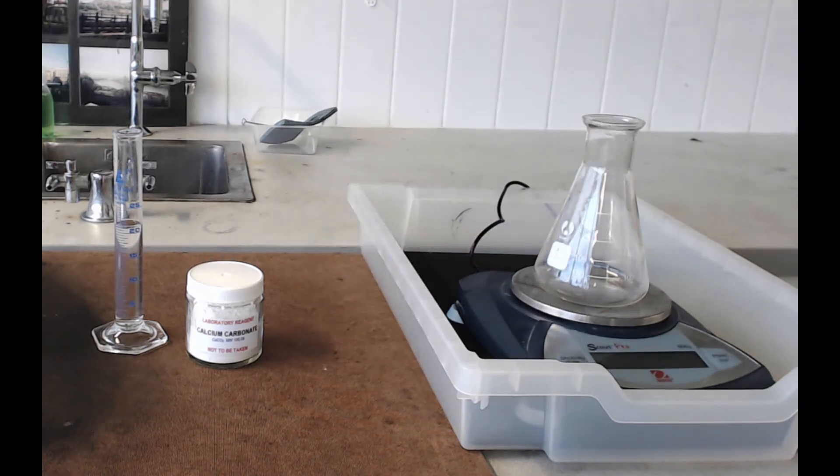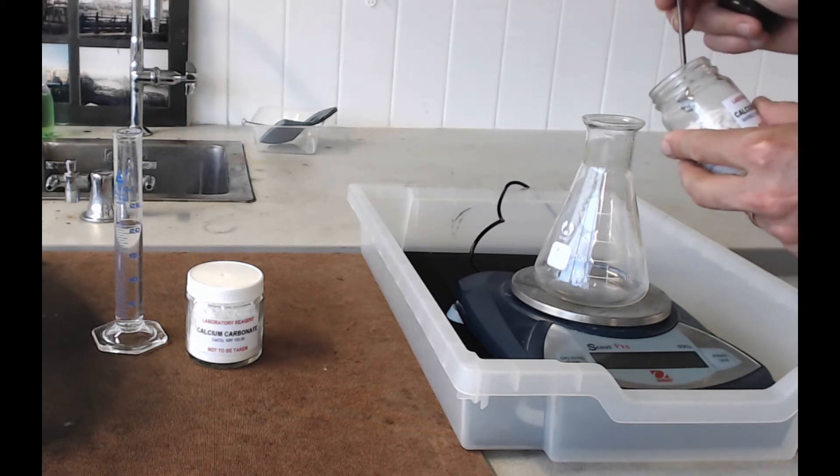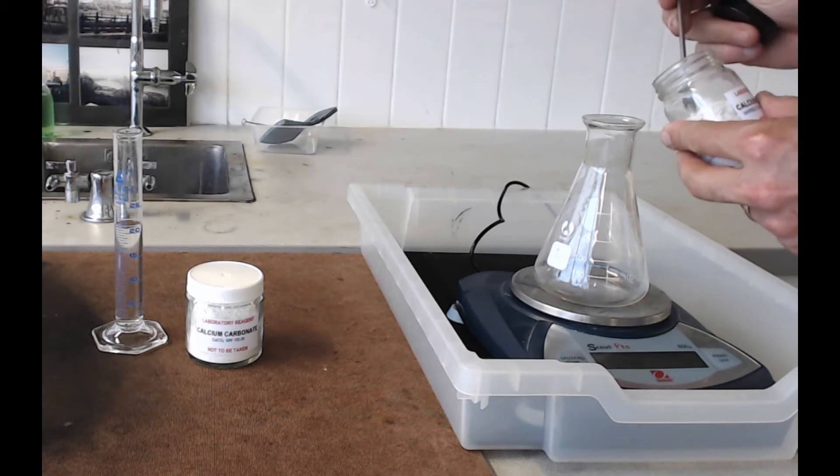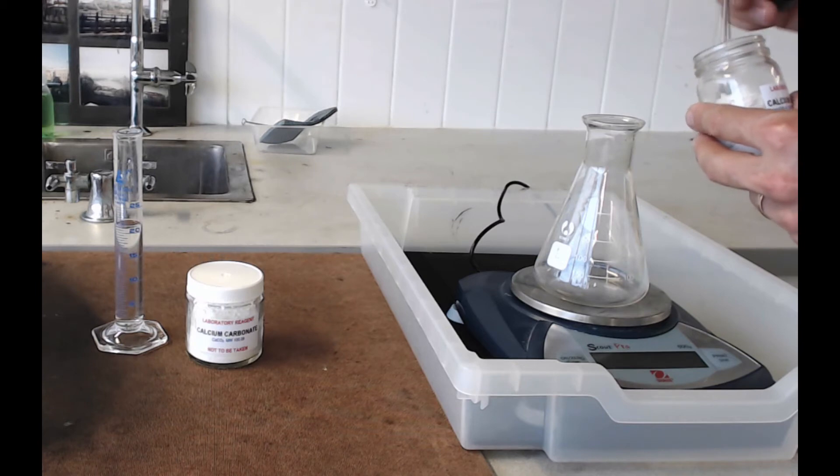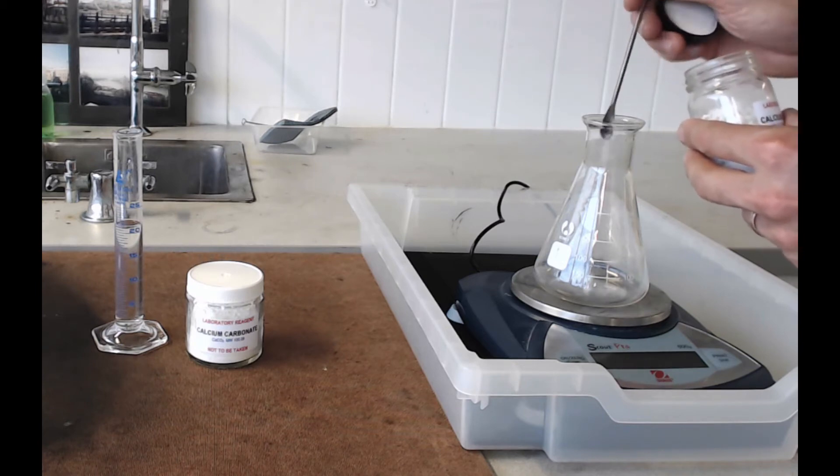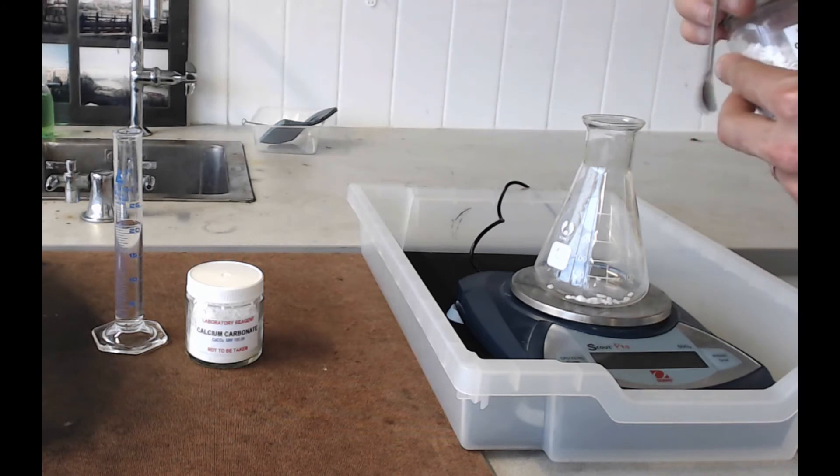As always, it's a good idea to keep things from spilling onto the balance. When you're weighing these things out, keep your jar close to the mouth of your flask - that way it's much harder to have a spill. Put two grams, or as close as you can to two grams, into your conical flask.